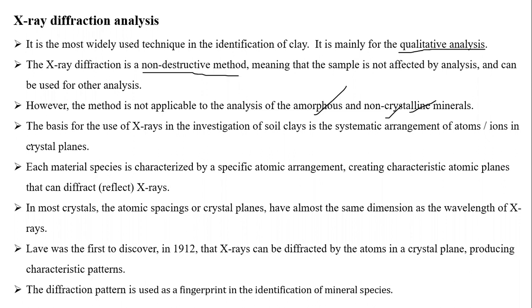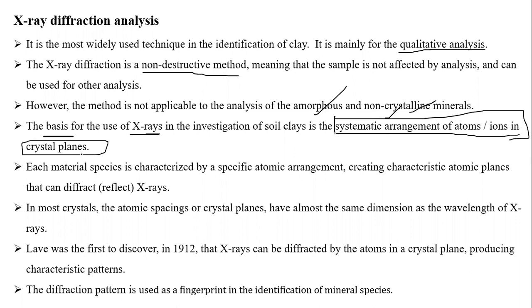Now, what is the base of X-ray diffraction analysis? It requires a completely systematic arrangement of atoms and ions in the crystal planes. This is the major fundamental base for this analysis. Whatever X-rays are spread on these atoms or ions will reflect a definite intensity of X-rays, which we can calculate. So each material species is characterized by a specific atomic arrangement.